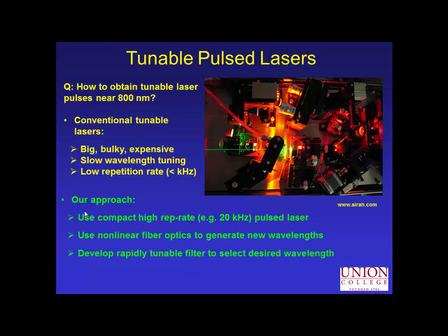So the approach that we're taking is to start with a compact high rep rate pulse laser and use nonlinear fiber optics to create new wavelengths. And then you can use a tunable filter to pick whatever wavelength you want.